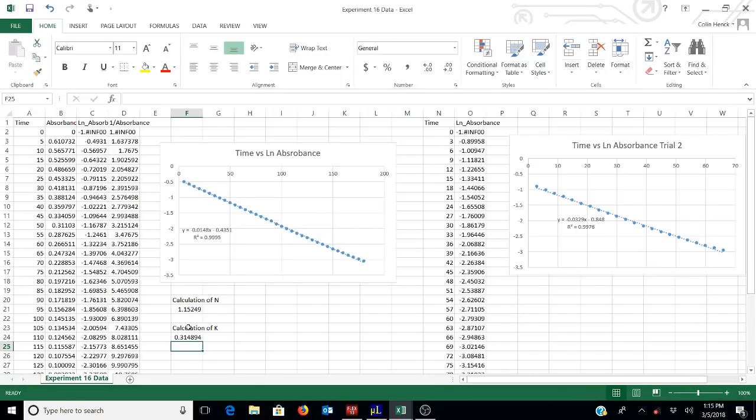So when we do things in lab, do we ever do them only one time? No, we do them repeatedly, right? So how can we do this measurement repeatedly? We can use different concentrations, exactly. So we've repeated this experiment multiple times. So this was for the first trial.